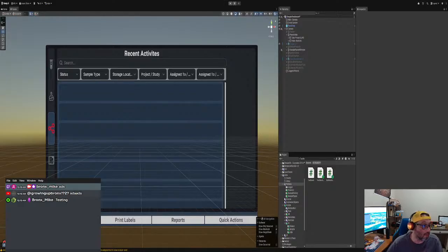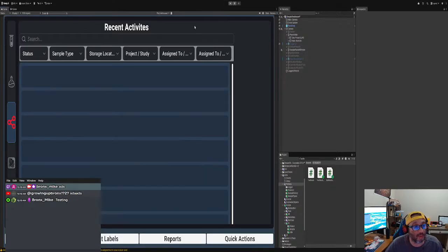All right, so last time what we did was we did the sample, right? So the sample panels, but we need to add to the sample panel. The reason why we have to add to the sample panel is because we need a test results panel, right? So right now we don't have any, but I purposely left that out just to make sure. Let me make sure I don't have any errors here.